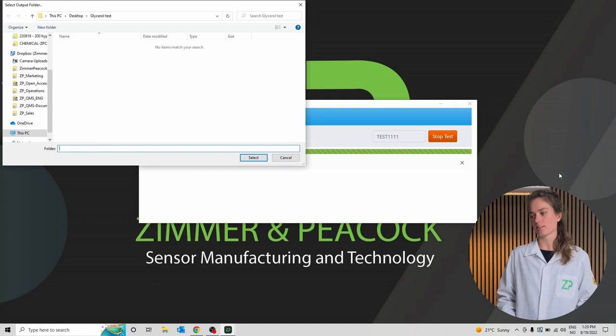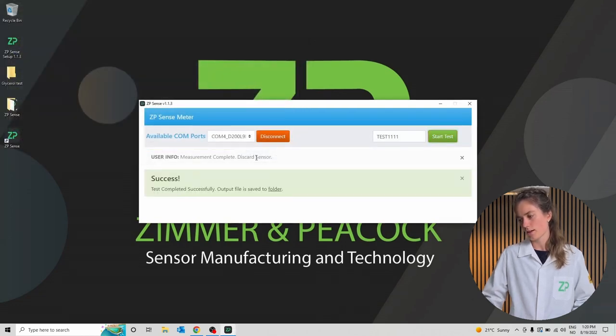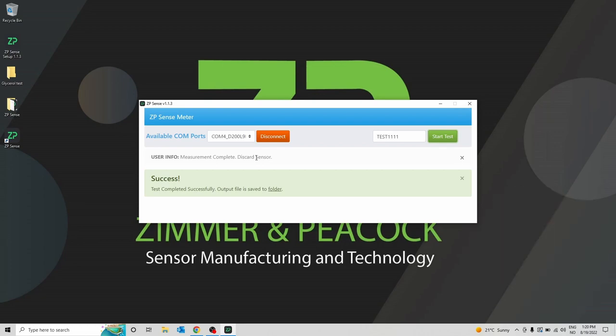Now the measurement is done and it's asking for a place to store the data. I've made a folder on the desktop called Glycerol Test. I'll click select and now it's successfully uploaded to this folder.